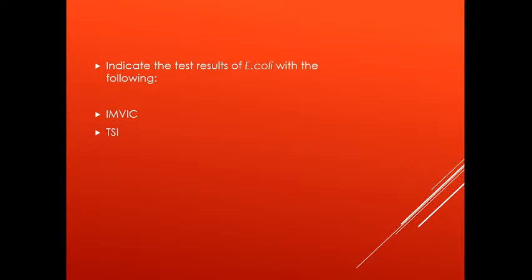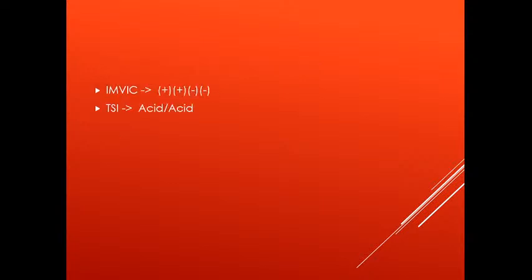Indole, methyl red, Voges-Proskauer, and your citrate test. So TSI is triple sugar iron agar. It's acid over acid. This is an example. This is the summary of the result.